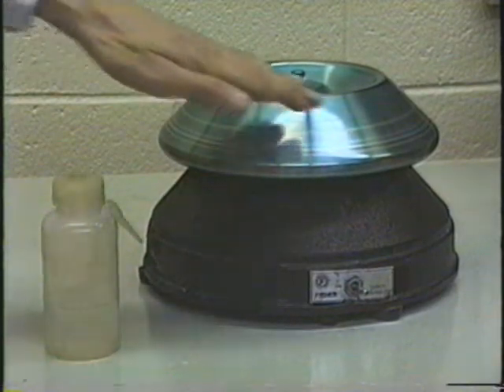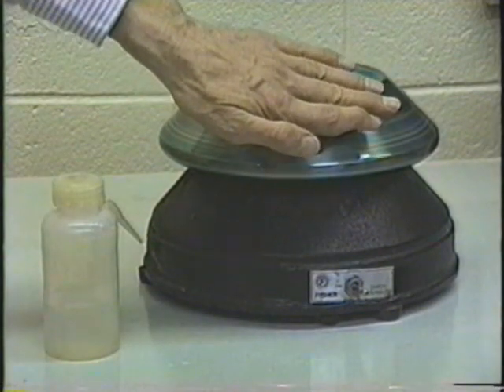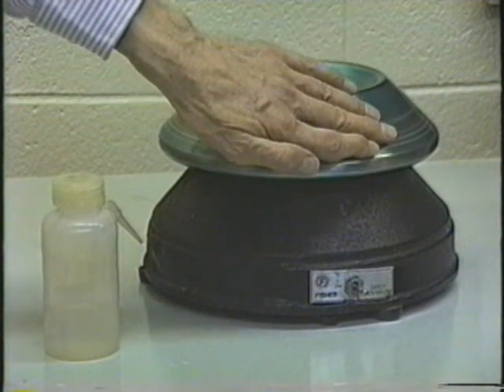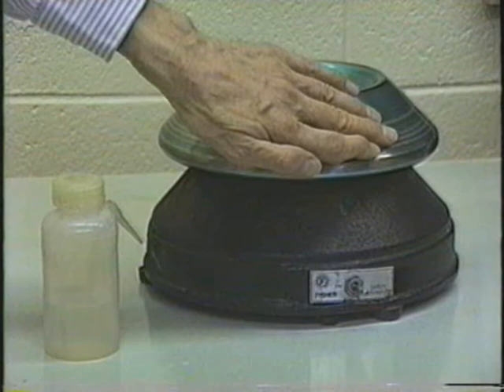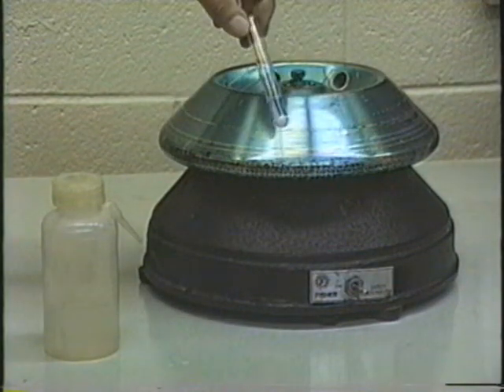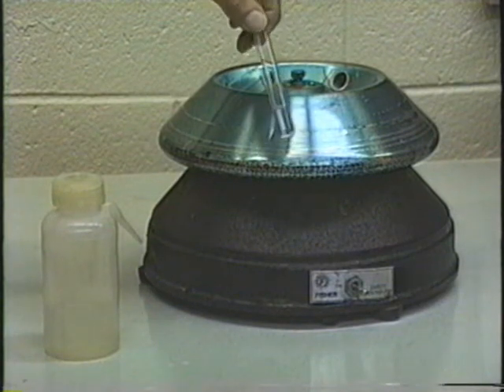Separation should be completed. Stop it, put your fingers so that they are in the same direction as the spin, and then lightly touch the side here. There's your separation. As you can see, it is completely separated.